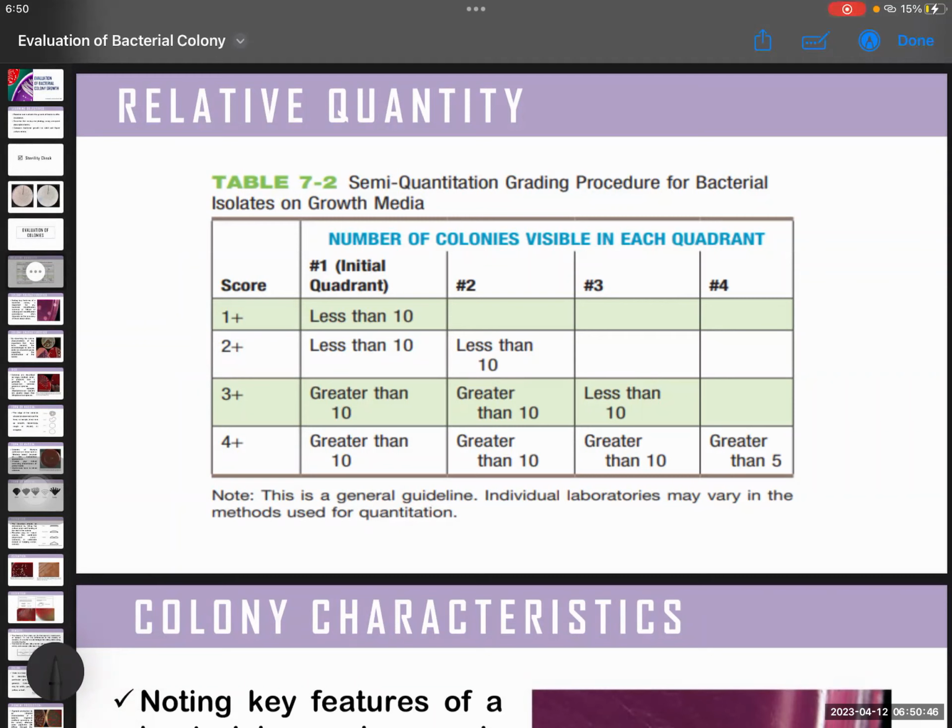Kasi, in order for a urine culture to be considered significant, it should have at least 100,000 colony-forming units per ml. Again, take note, in order for urine cultures to be significant, meaning there could be a potential bacterial infection within the urinary tract, it should have 100,000 colony forming units per ml quantity of bacteria.